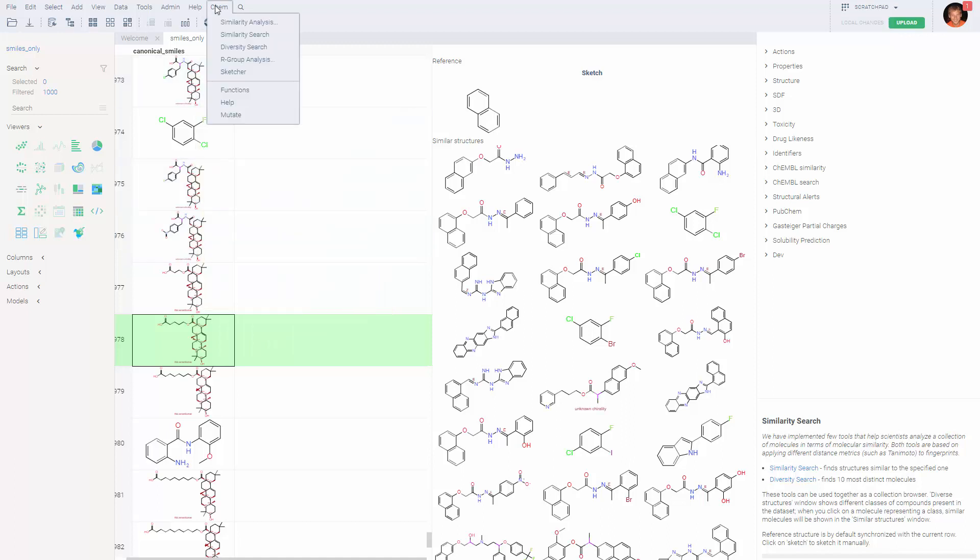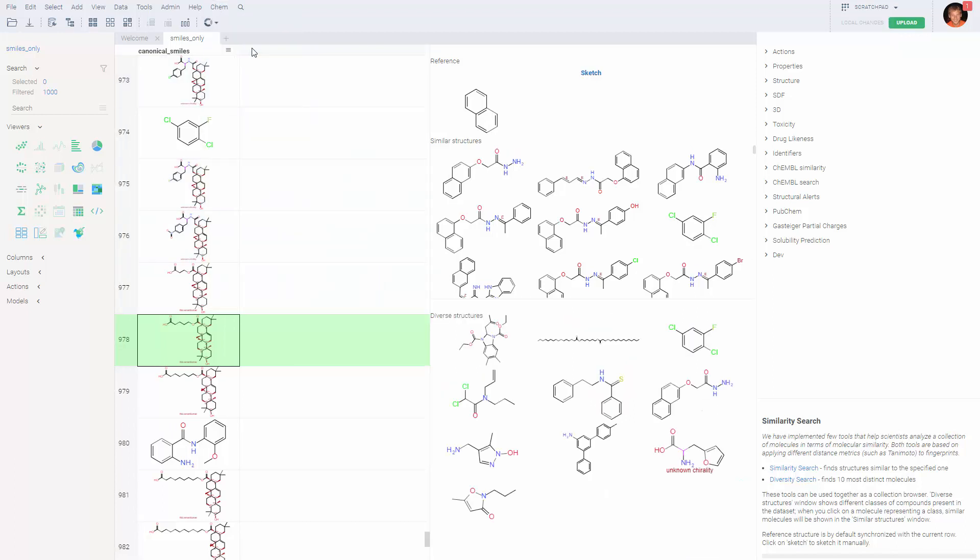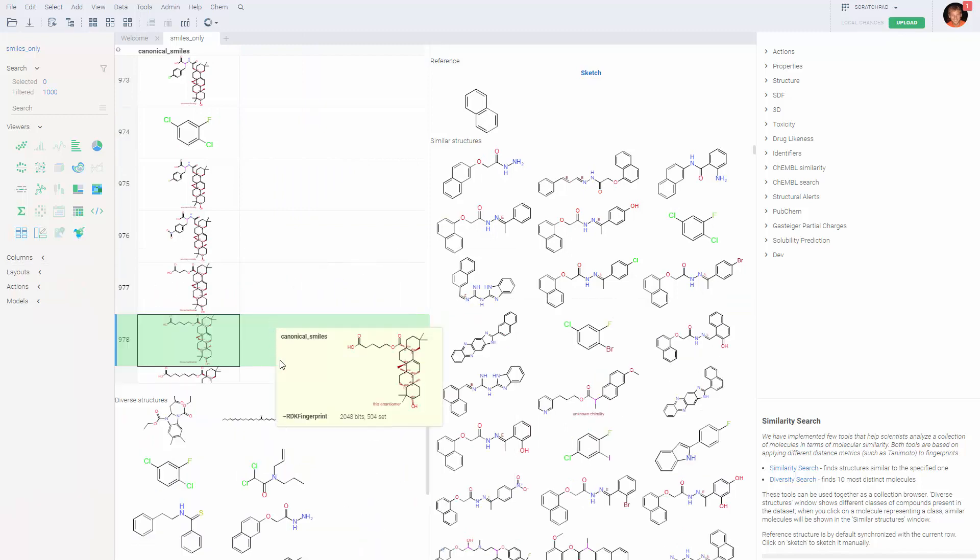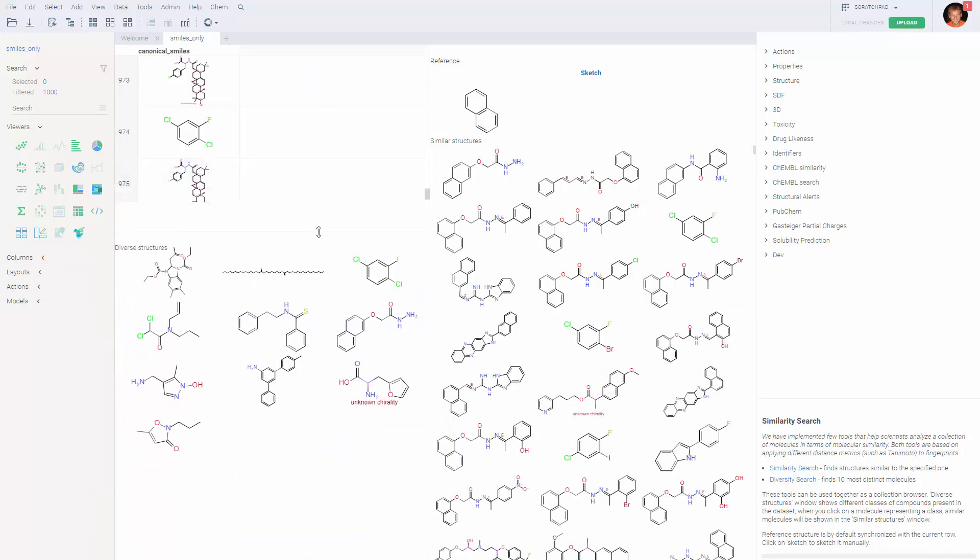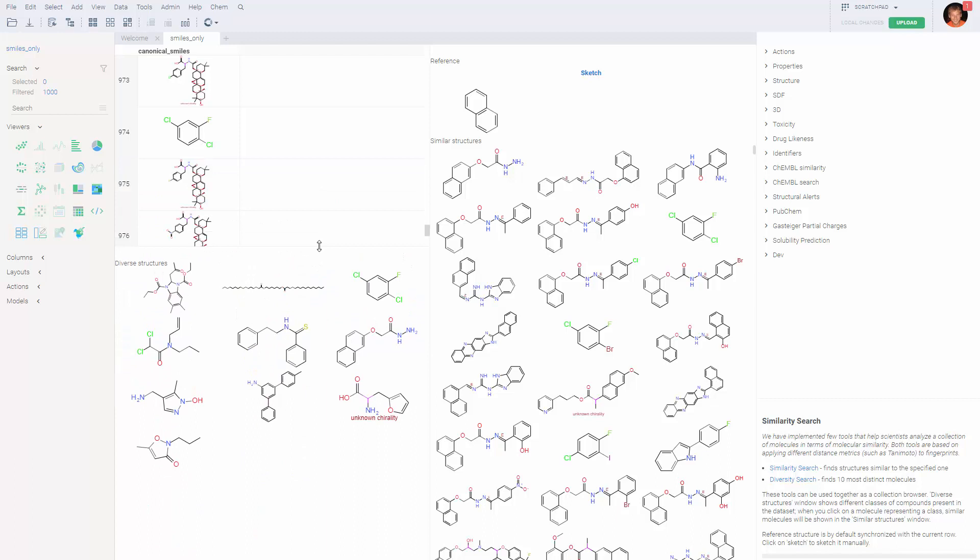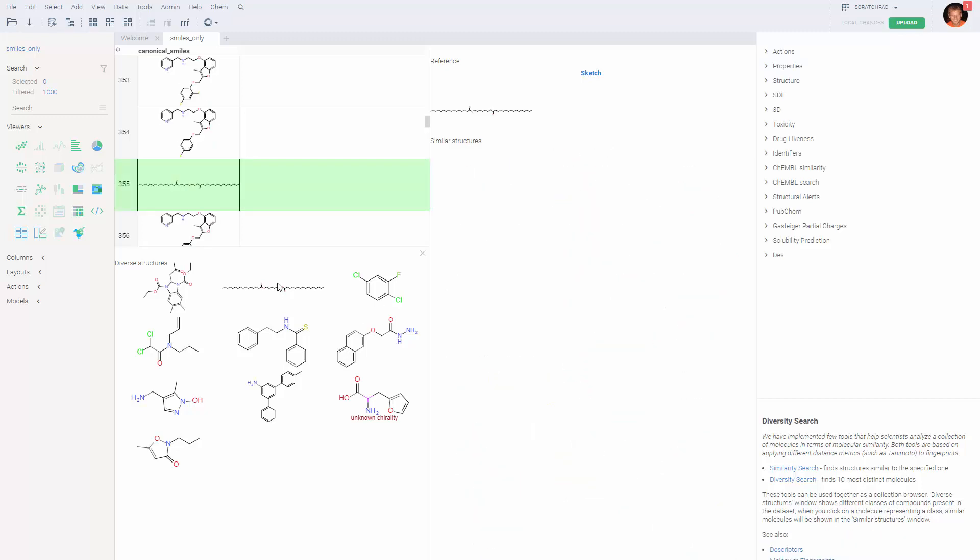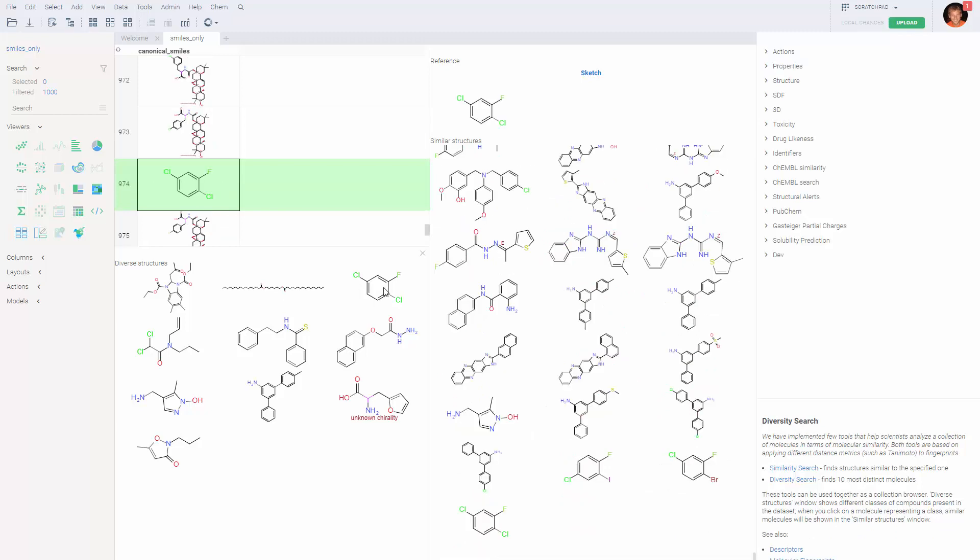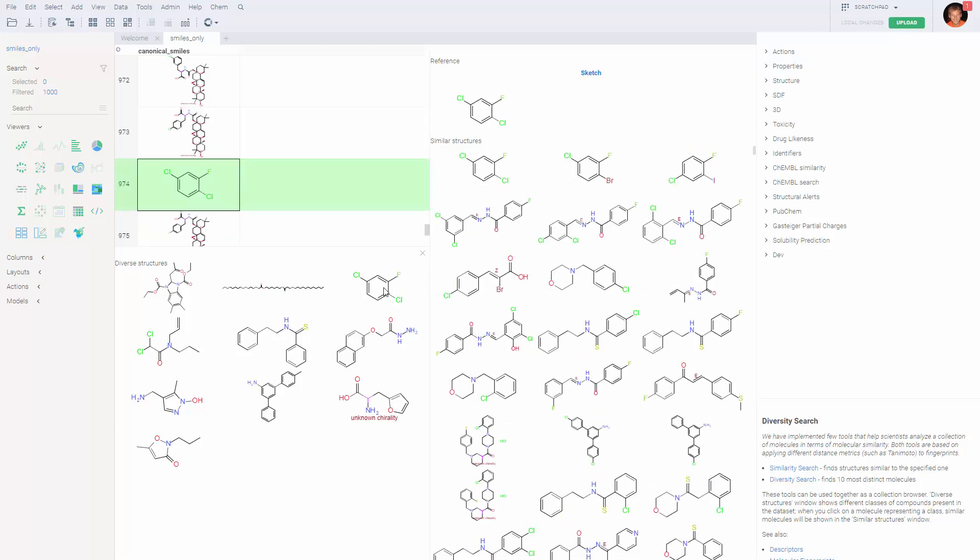A similar tool to similarity search is a diversity search. I would say it's actually the opposite tool. What it does is that it finds ten most different molecules in our dataset using the same metric, Tanimoto score against the fingerprints. So, it shows us different examples of different classes of molecules that exist in our dataset, which is a powerful tool for figuring out what's in the dataset.